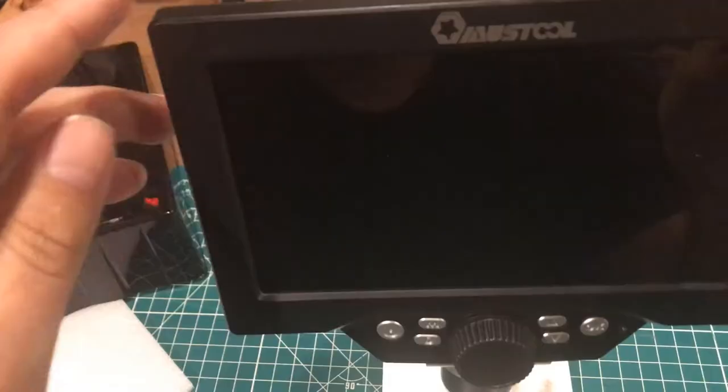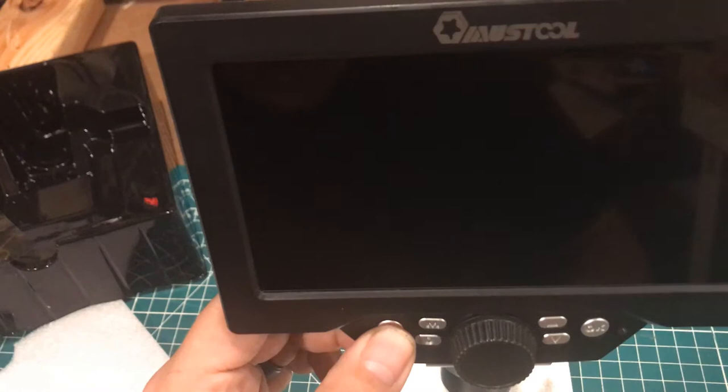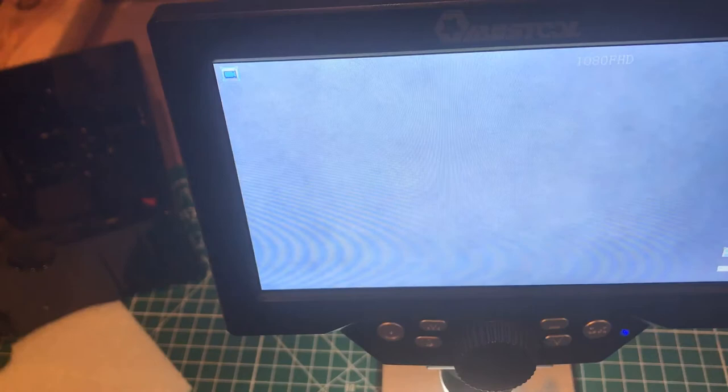I have it roughly together. Let's go ahead and peel this off — very satisfying. Let's see if it's got a charge on it. Okay, that's pretty quick booting. Let's get this under here and see what you guys can see.